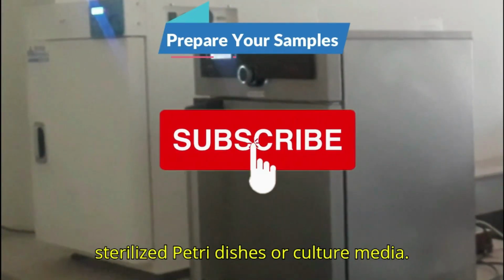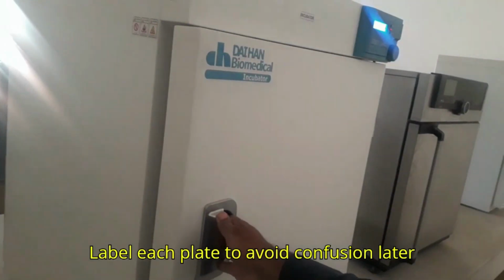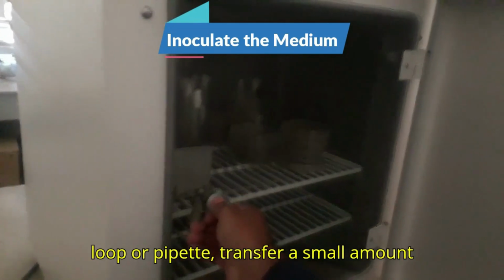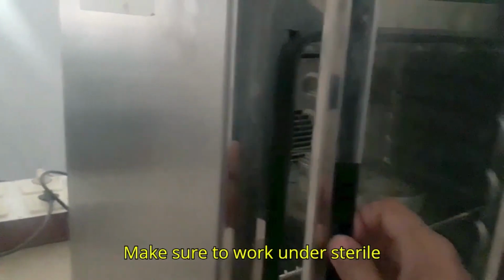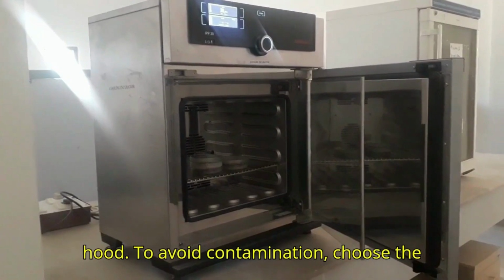First, gather your sterilized petri dishes or culture media. Label each plate to avoid confusion later on. Using a sterilized inoculation loop or pipette, transfer a small amount of your microbial sample onto the media. Make sure to work under sterile conditions, such as in a laminar flow hood, to avoid contamination.